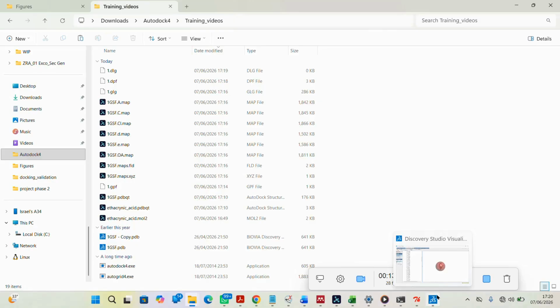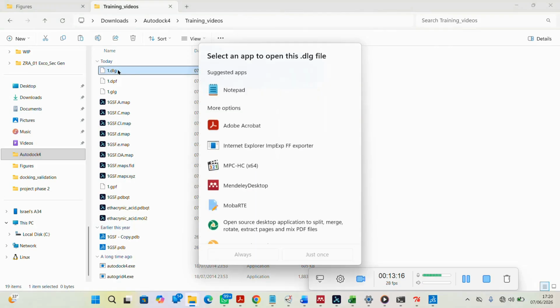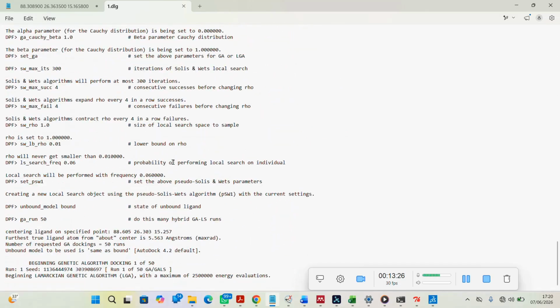Just ensure that your system has enough power to continue the process till it is ready. Then you can even open the file with Notepad to confirm it is running, and you can see that yes, it has started, setting up library and so on. So it's already running. We'll just come back when the process is completed. It can take several hours depending on what you're working on.